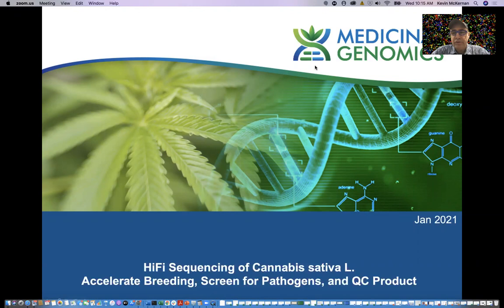So we're going to break this up into some of the assembly statistics first, and then how those references have enabled other sequencing tools and genotyping tools to make better use of the reference genome, and then also any cloning exercises that we've embarked on to get interesting enzymes out of the genome and utilize those for industrial purposes.